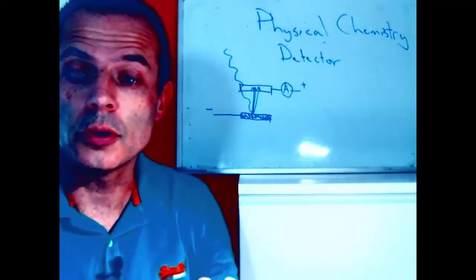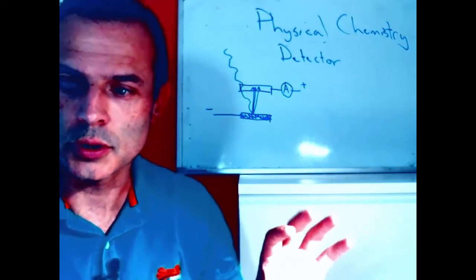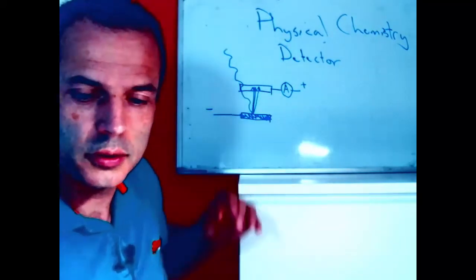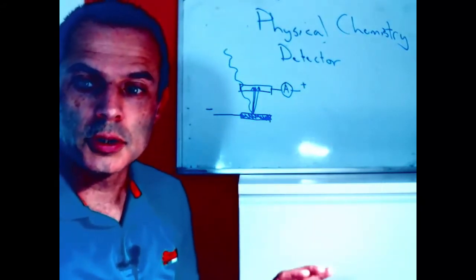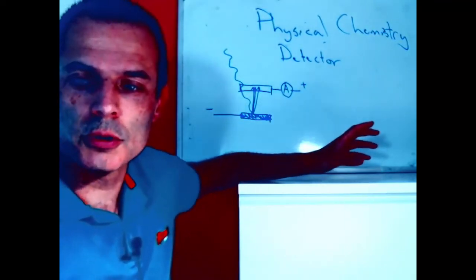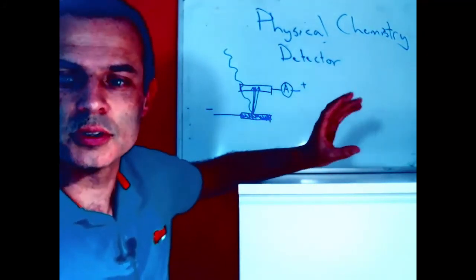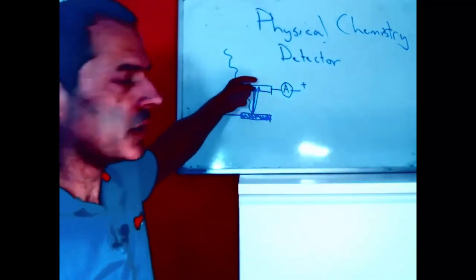There are several types of X-ray detector, but we'll talk first of all about this one, which is a type of semiconductor. The X-ray comes in, it knocks out a certain number of electrons dependent on its energy. So the accuracy of our detector depends on the band gap, and we try to make it as small as possible. But there's a problem, obviously, because if we make it too small, we will get too much noise from the thermal electrons being knocked up.